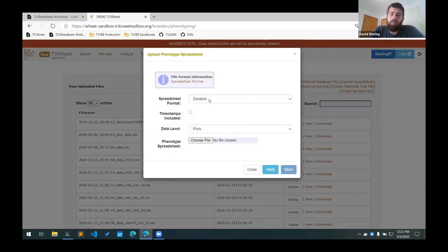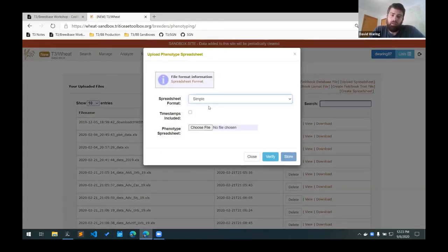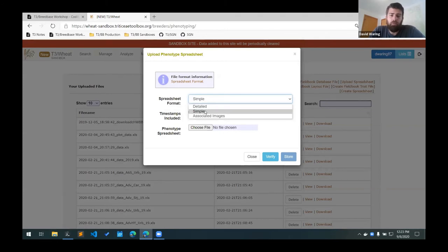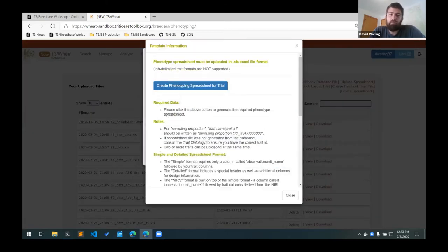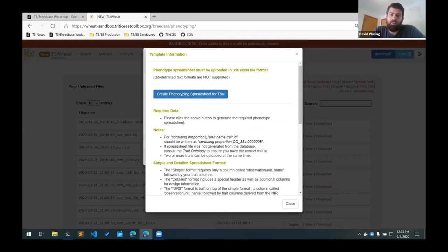And the format that we're using is simple. The detailed format just has some extra trial level metadata at the top of the page, but it's easier just to use the simple template. And again, there's some more information about the spreadsheet format here.